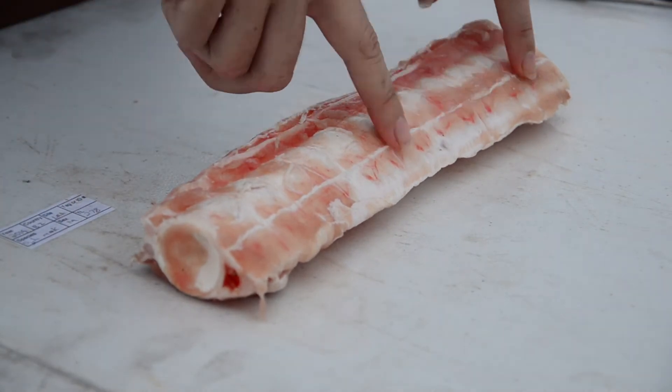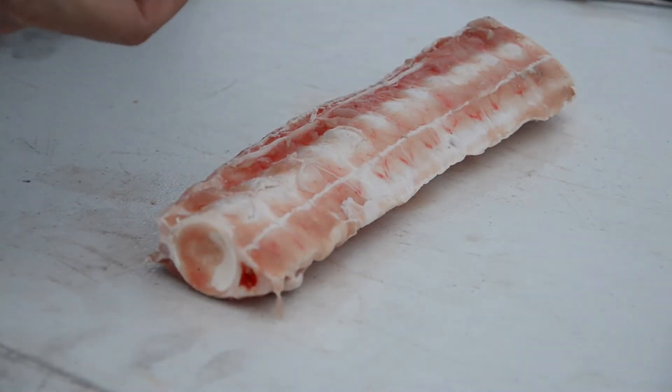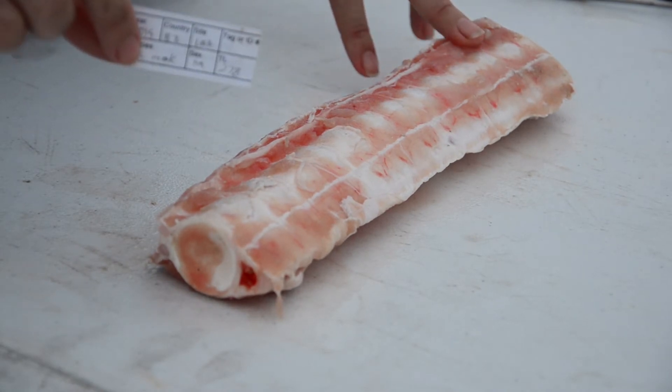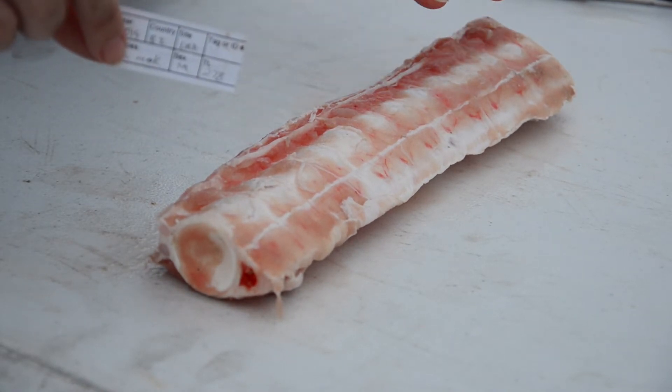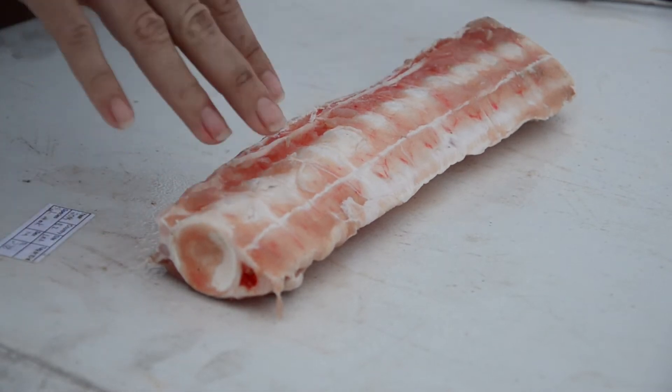The one important thing to remember is to always keep your label with your sample, especially if you're doing more than one at once. It's extremely important to make sure that your label stays with your sample.